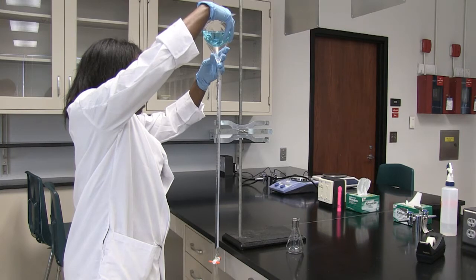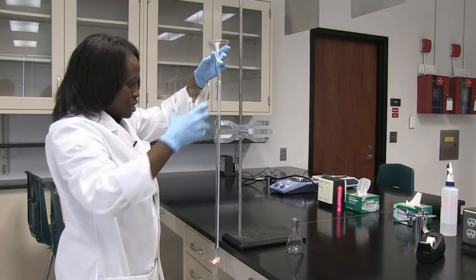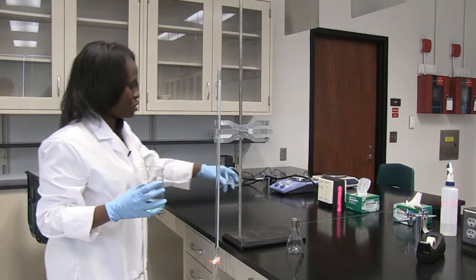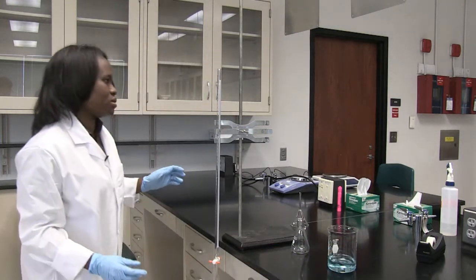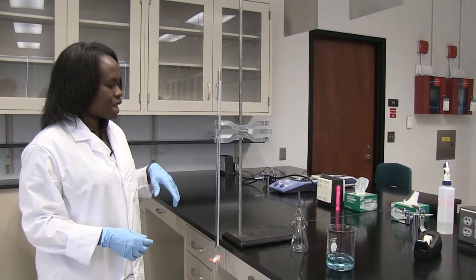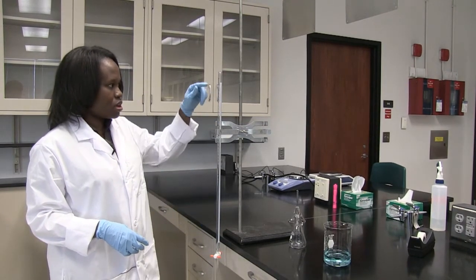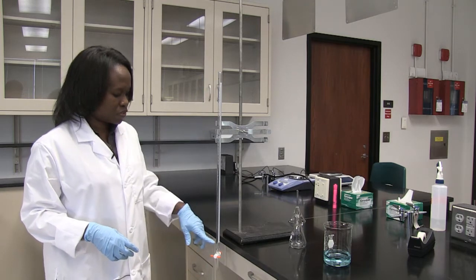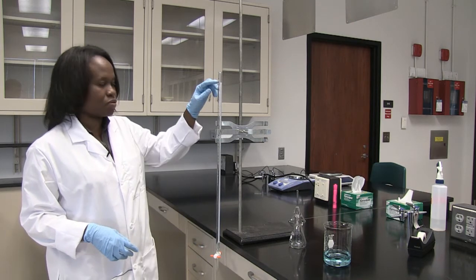Actually, because I want 20 mils to be in the burette, I'm going to add it a little bit above the 20 mil mark, so that I can get the most accurate measurement coming out of the burette into my Erlenmeyer flask. One important thing I wanted to mention about the burette is that unlike some pipettes where the gradation starts from 0 up to 50, the burette actually has increments starting from 0 at the top to 50 at the bottom. The pipette would normally have gradations from 0 at the bottom to 50 at the top.